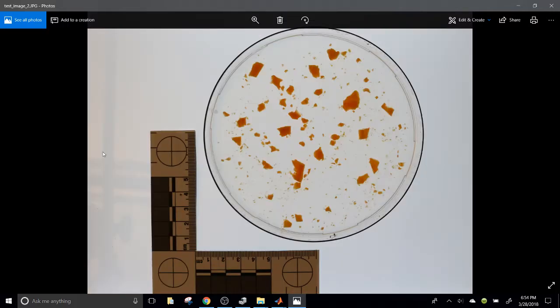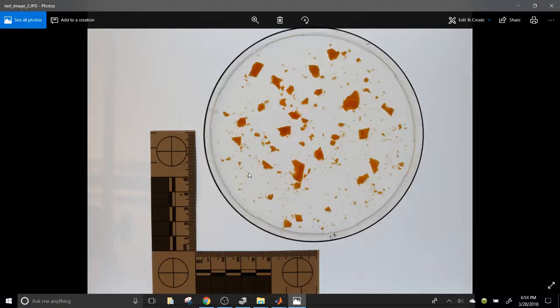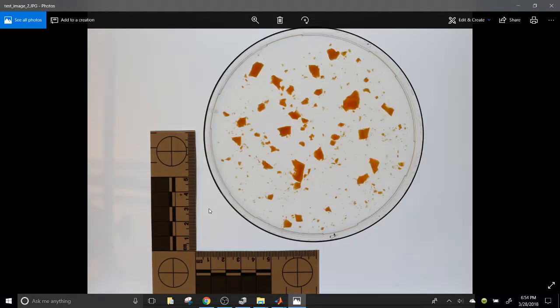And then second, here you notice that the scale is brighter and there's less shadows. So on this other image, you can see there's some shadows, like this long thing right here, which is part of the image stand and one of the turn screws. The scale is darker overall, and it won't matter. But the reason for that is because here the light's pointing from the top to down, so the light's pointing on the dish and the scale were not on, whereas here they were on. These are the ones that I'm referring to as the stage lights in some of these documents. So we want to keep them on if possible. They help reduce things like shadows and make the scale a little easier to see.